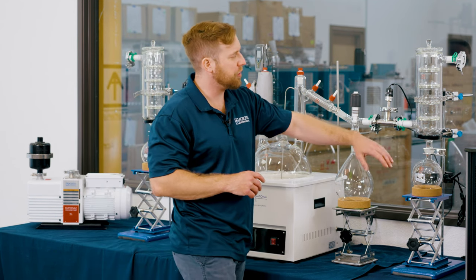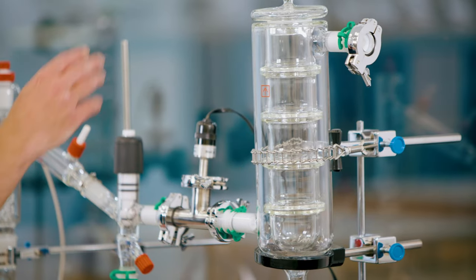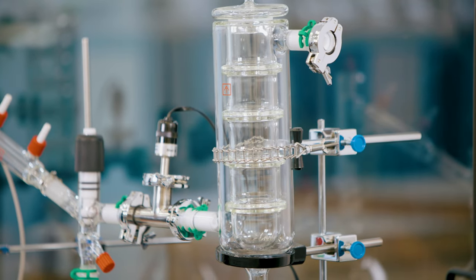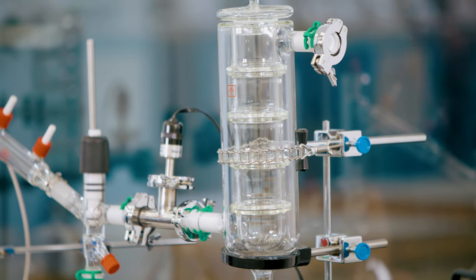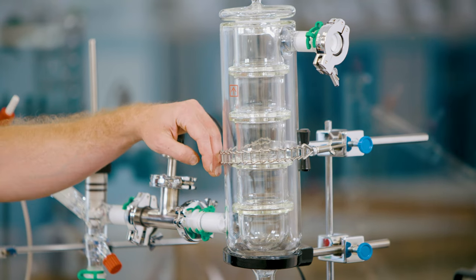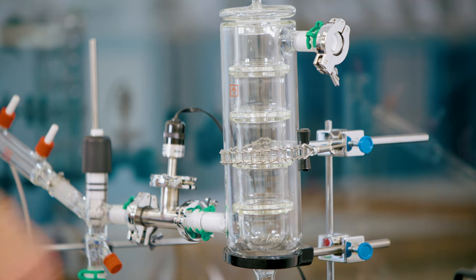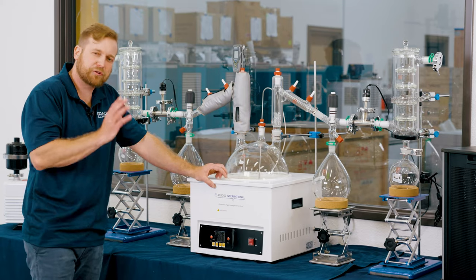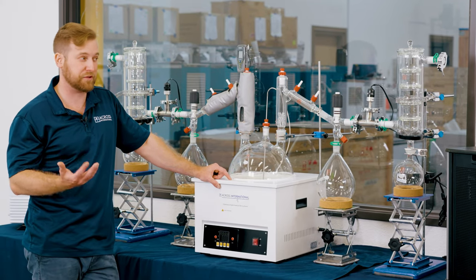From the T here, we're going to go to our cold traps. These are standard AI glass cold traps, Dewar-style cold traps, and we'd be able to put dry ice inside of here or an immersion probe in order to cool that down and make sure we trap any vapors that are coming out through the system.